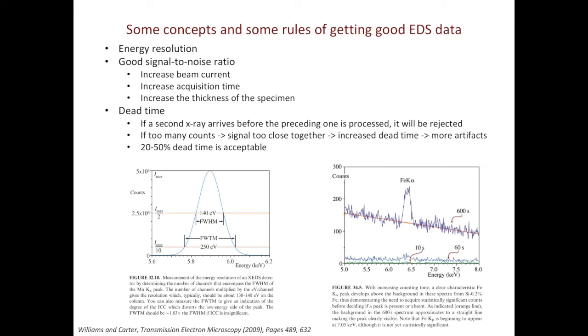When collecting EDS data, you always want good signal-to-noise ratio. There are a few strategies. The first is to increase the beam current. By increasing the beam current, you increase the events of inelastic scattering. The second strategy is to increase the acquisition time. Here's one good example from the textbook. When the acquisition time is 10 seconds, you don't really see the iron peak. When you increase the acquisition time to 60 seconds, you see a small peak. When you do acquisition at 600 seconds, you see a very prominent peak.